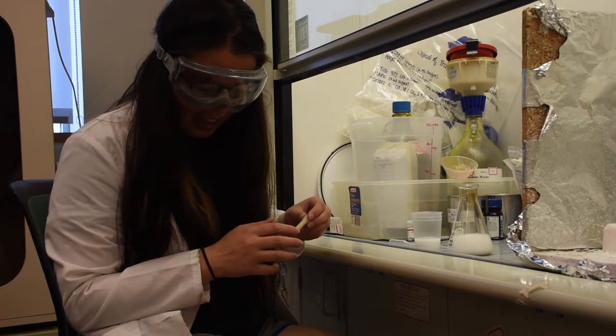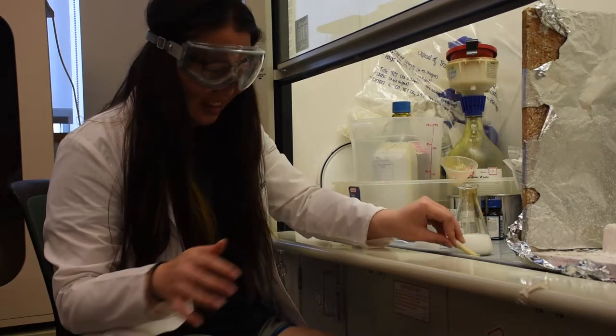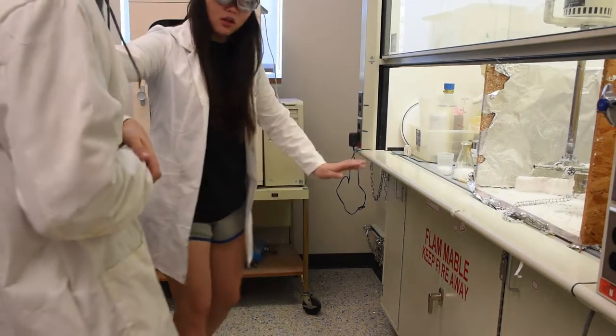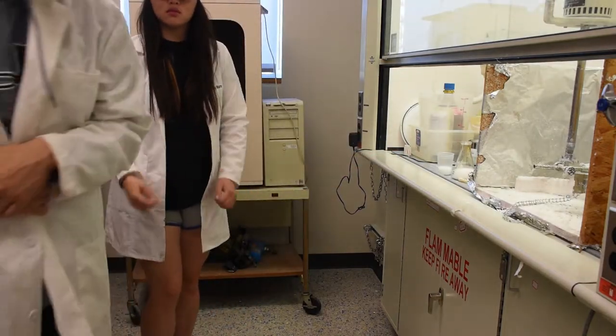If you spill an acid or base on a countertop or floor, follow these steps. Secure the area. Make sure people around you know that you spilled a hazardous material.